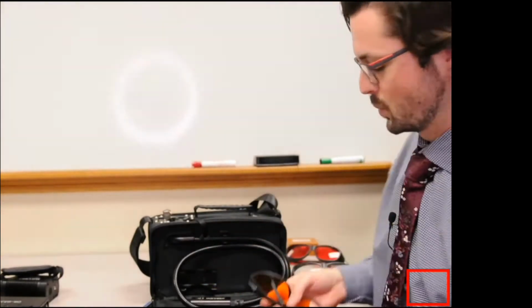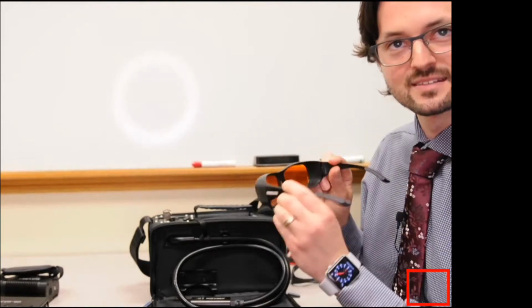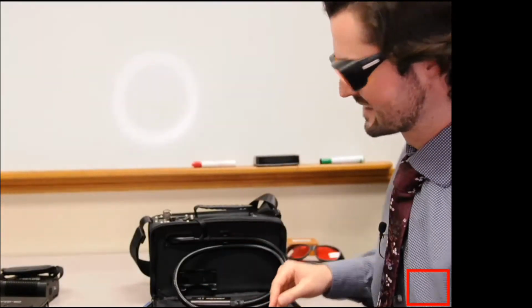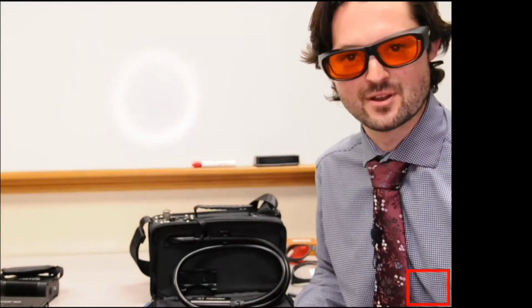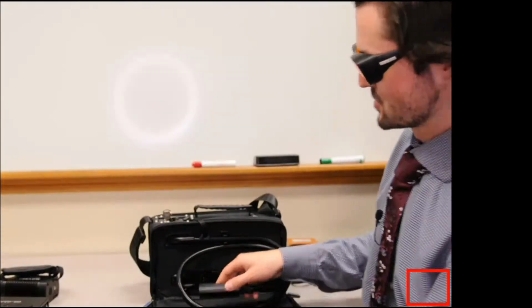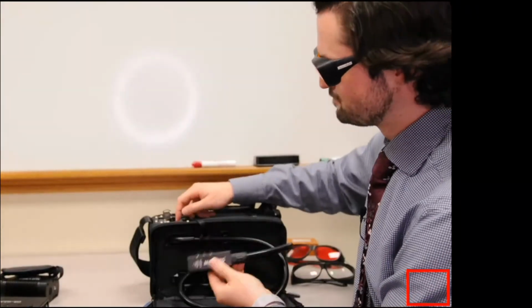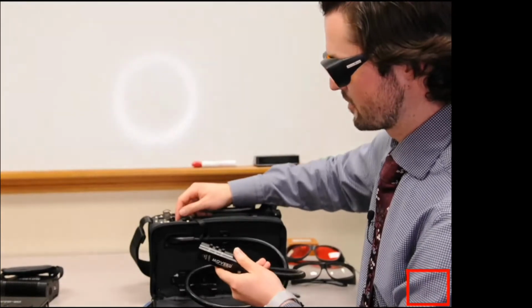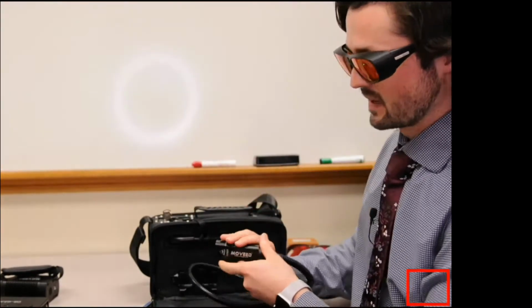So I'm going to go ahead and put on my nice goggles. And notice, oh man, they go right over my glasses. I can't tell you how long it took to find a pair of goggles that would go over glasses and work really well. But yeah, so what we're going to do is we're just going to power up the laser. We've got our excitation source. This is our little controller. I'm going to hit power. And now the laser's on.